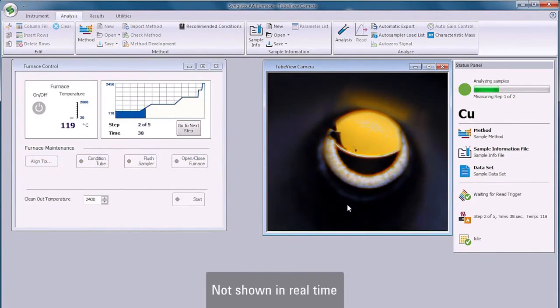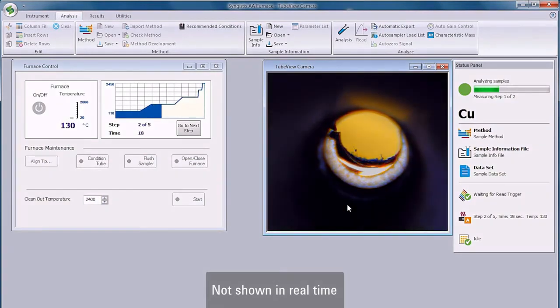With the correct drying conditions, the sample will dry smoothly and evenly in the drying phase of the program.